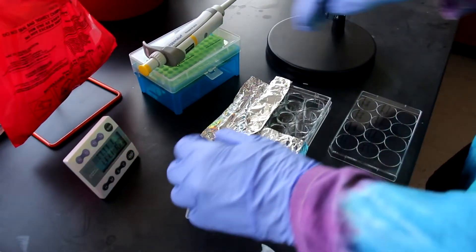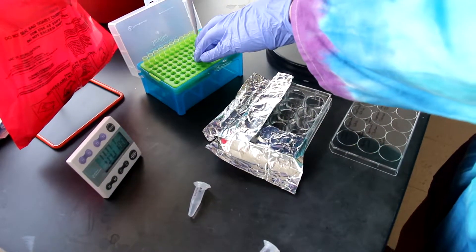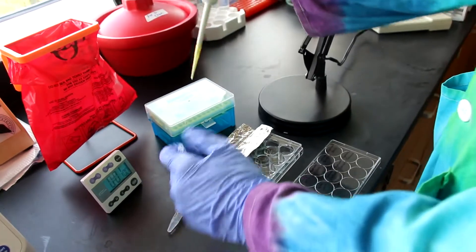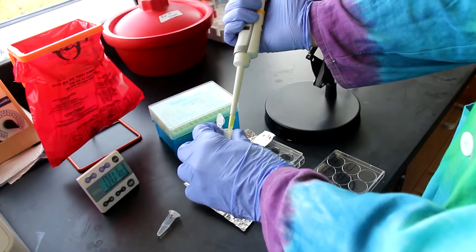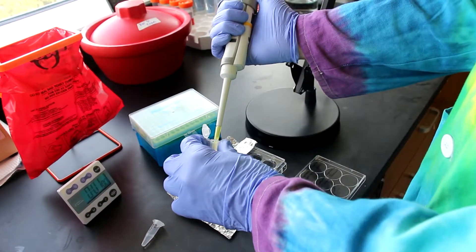Then as before, using a P20 pipette, add 20 microliters to each well quickly, wait five seconds, and then photoconvert for a minute.